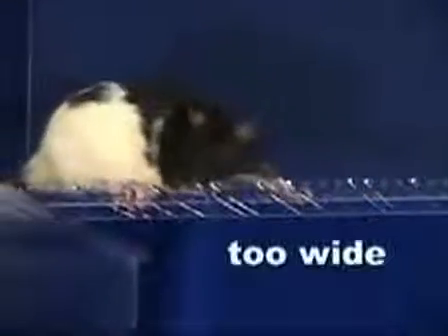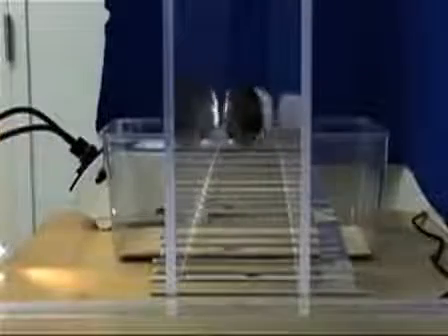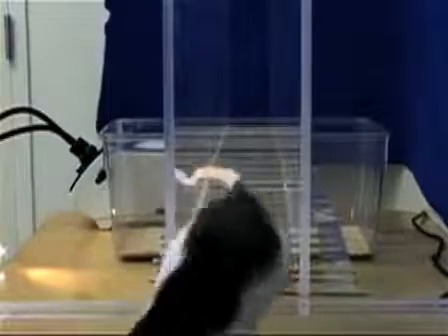The walls of the apparatus can be adjusted to suit the size of the rat being tested. The wall spacing should be narrow enough to prevent the rat from turning around while in the apparatus, but not so narrow as to impede the rat's natural walking movement. One centimeter of clearance on either side of the rat should be sufficient.